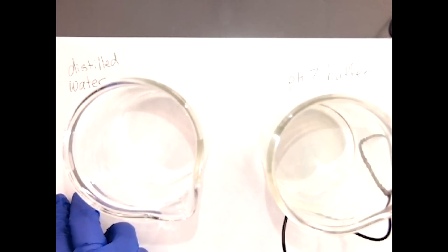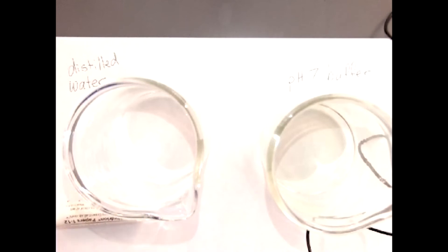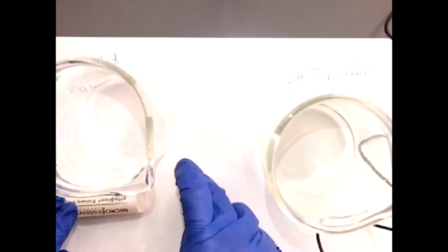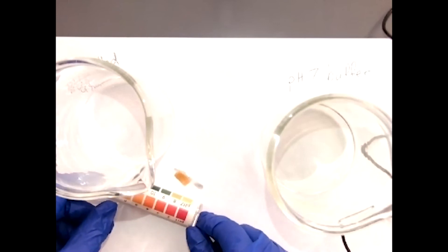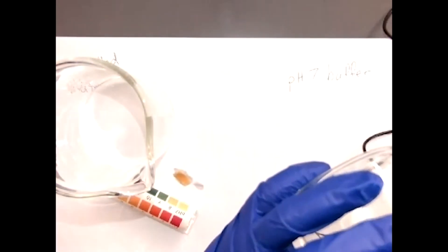Next it says to measure and record the pH of each. Grab our pH paper. We are just verifying that both of these actually have a pH at or near seven. All right, pretty much no color change there, so that's going to be about a seven. And buffer, this one's a bright yellow, so that is definitely seven.